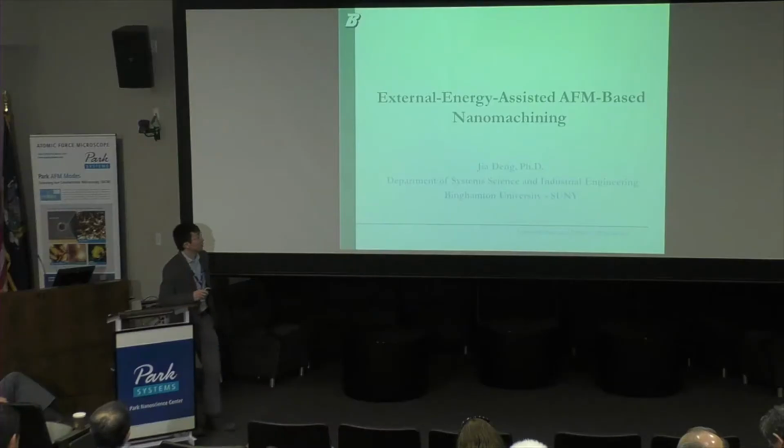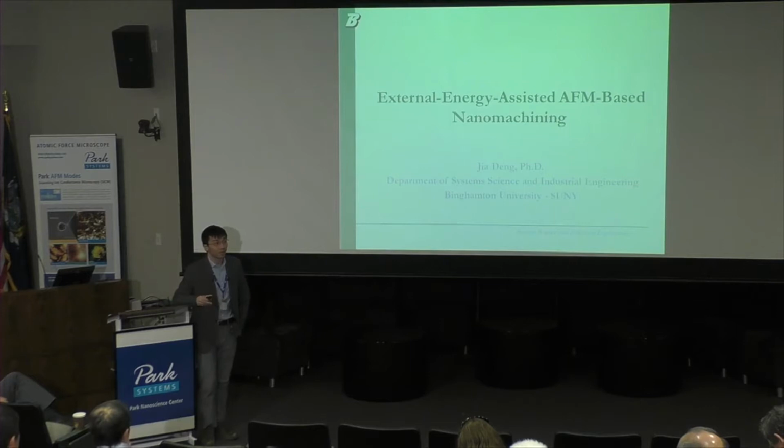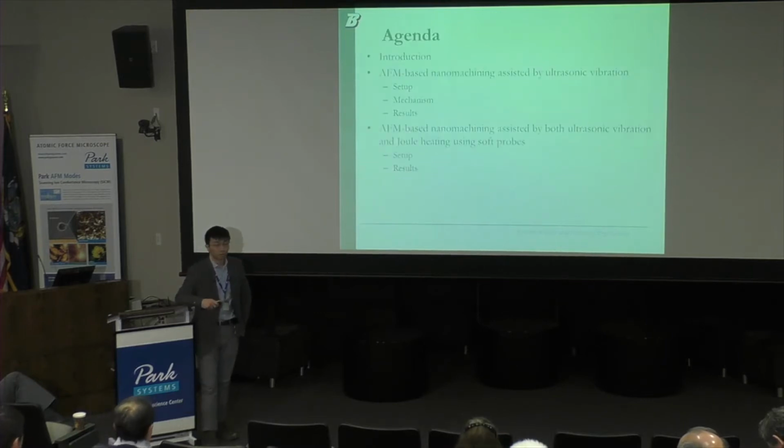It's good. So okay, today my topic is about AFM-based nanomachining. Specifically, I'm using external energies to assist the nanomachining process. Today, I'm going to cover AFM-based nanomachining assisted by ultrasonic vibration, which is only mechanical vibration. I'm going to show the setup, mechanism, and the results.